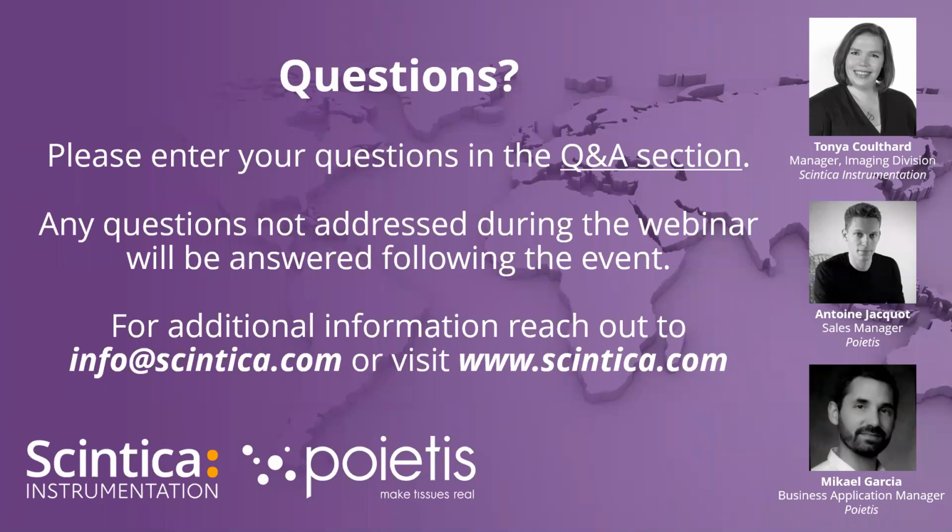Antoine, anything that you want to add? I don't remember what the percent viability with the laser-assisted bioprinting is. That's a number that escapes my head. It's close to 95% actually, and as you explained, there's literally no shear stress with laser bioprinting because it's a nozzle-free technology. That's the whole point of printing cells with laser: you can bypass and avoid all these pressure and stress problems, and that's why the cell viability ratio skyrockets. Yeah. Perfect.